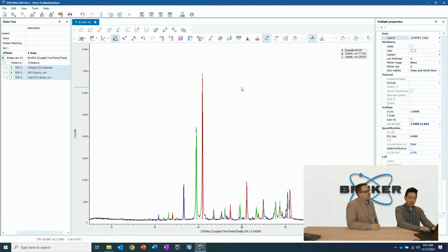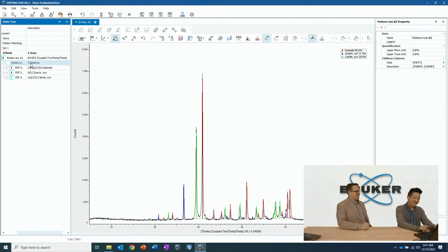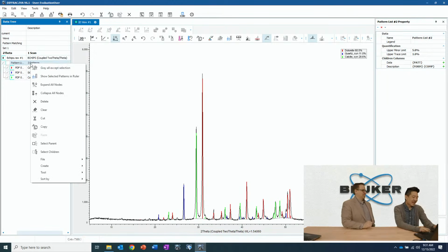Now what if I want a pie chart? You wanted a pie chart? Can you do that? I could, but I don't like pie charts. I like bar charts. Can you make a chart? We can make a pie chart.